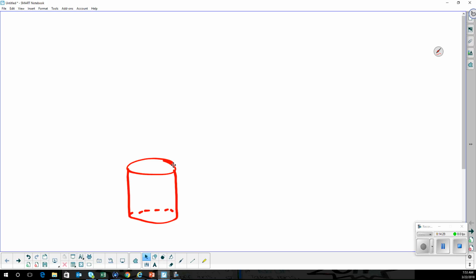You're going to go back to the south end of the lab, on the carts, is where your buffers are. Whether I gave you buffer A or buffer B, you're going to get 5 milliliters. There are pipette pumps back there. You're going to get 5 milliliters with the pipette pump and put it into your big beaker. Here we're going to want to put an indicator in.